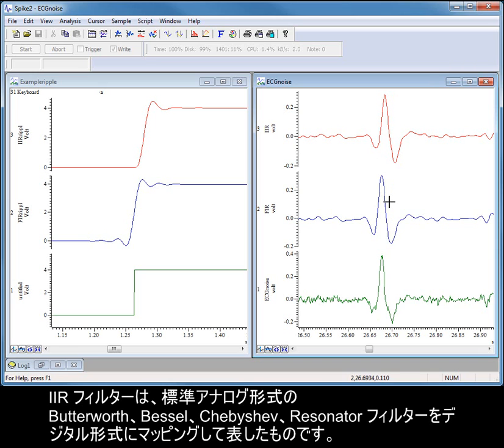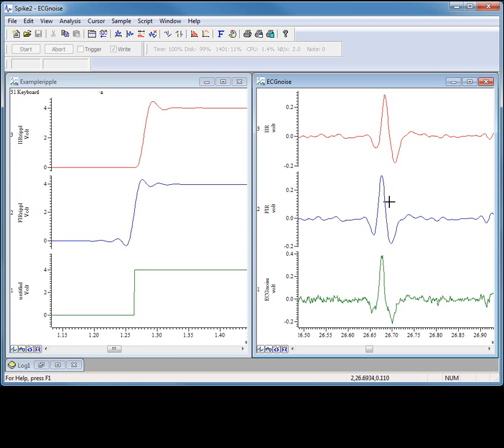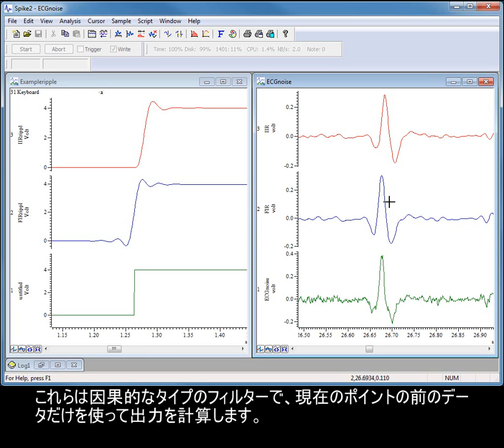IIR filters are representations of standard analogue Butterworth, Bessel, Chebyshev and Resonator filters mapped into digital form. These types of filter are causal; they only use data before the current point to calculate the output.